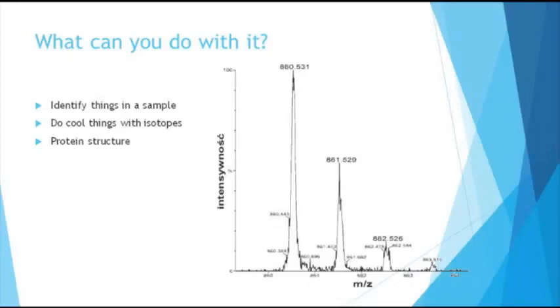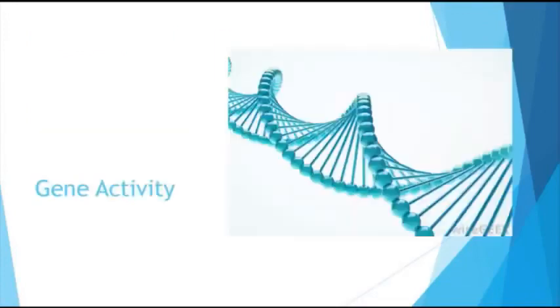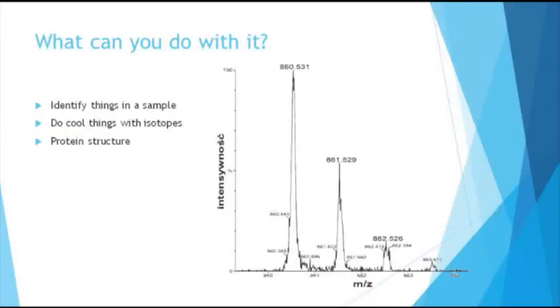Something that is useful in medicine is you can use it diagnostically. So for instance, say you take a urine sample from a normal patient, and then you take a urine sample from someone with, say, prostate cancer. Even though you might not know what the individual peaks are, if you can see a difference in profile, then maybe you can start to use that diagnostically, so you can check for prostate cancer from a urine sample. And I think probably the most common usage in terms of what you guys will see is testing for samples. So for instance, testing for the presence of explosives, presence of drugs, etc.